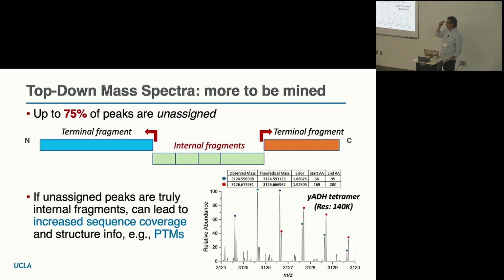Yep. Ultraviolet photodissociation. So using a laser at 193 nanometers, or 213 in the commercial Thermo instruments. That produces every letter in the alphabet type of fragment ion for proteins. It just blows up the protein into all kinds of pieces, and it's quite effective for fragmenting any kind of molecule.